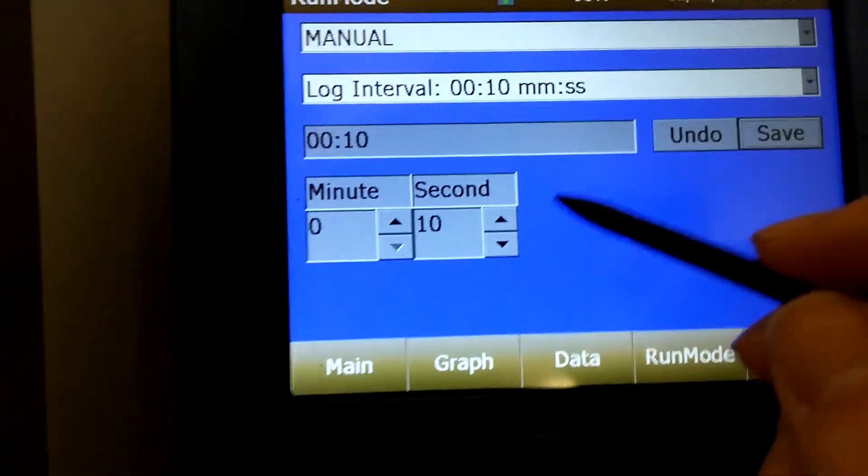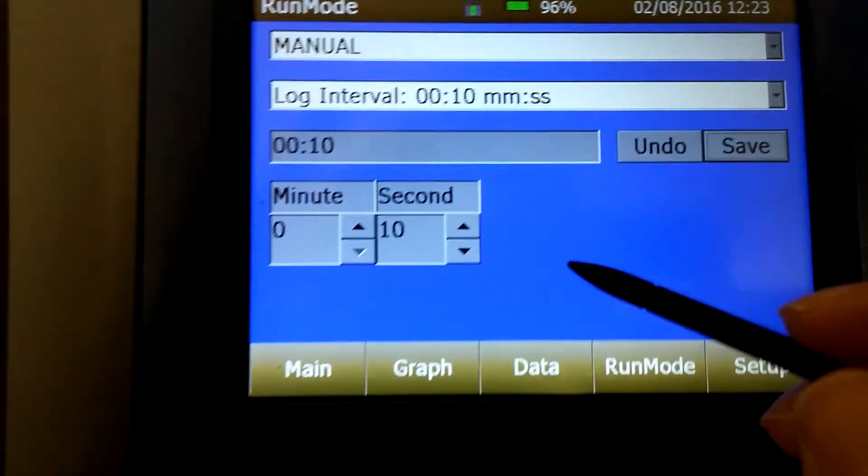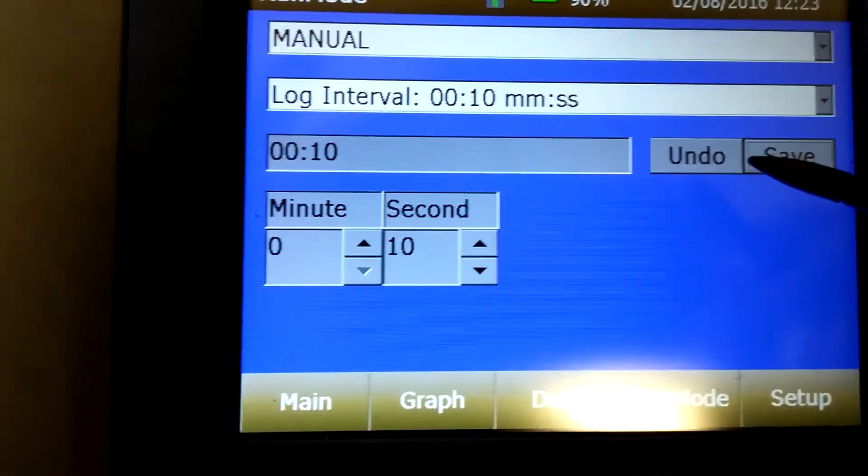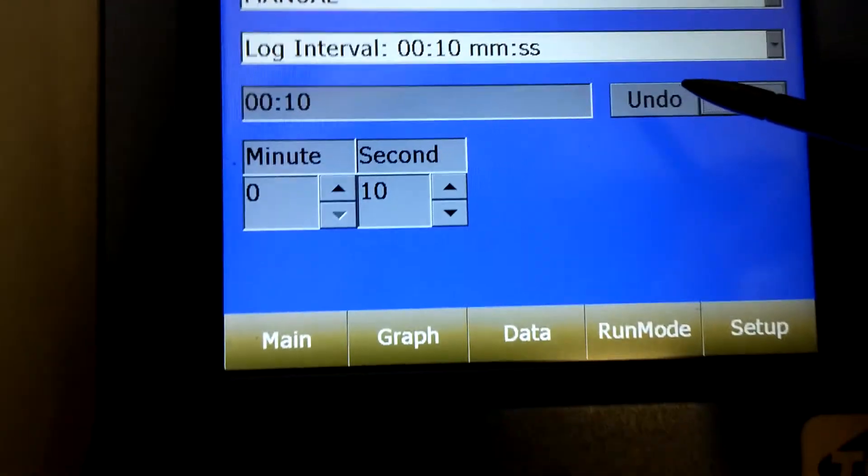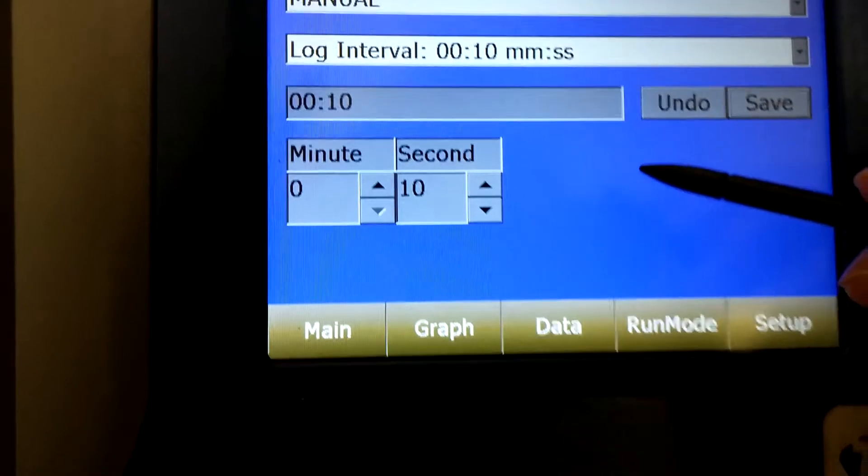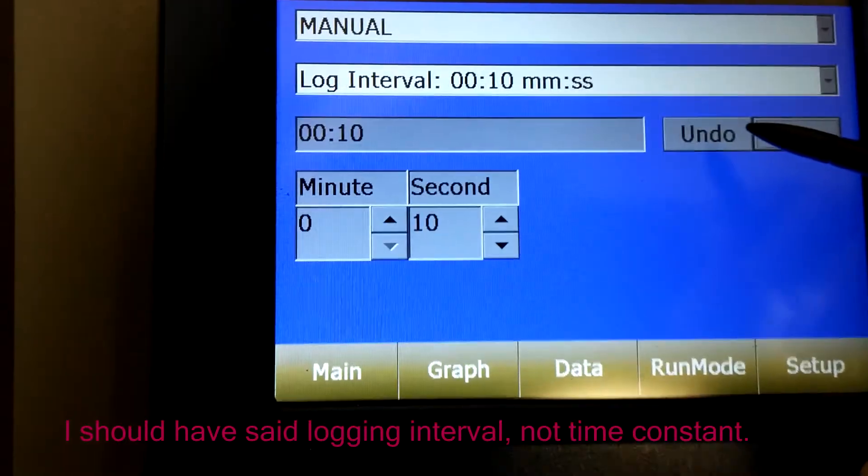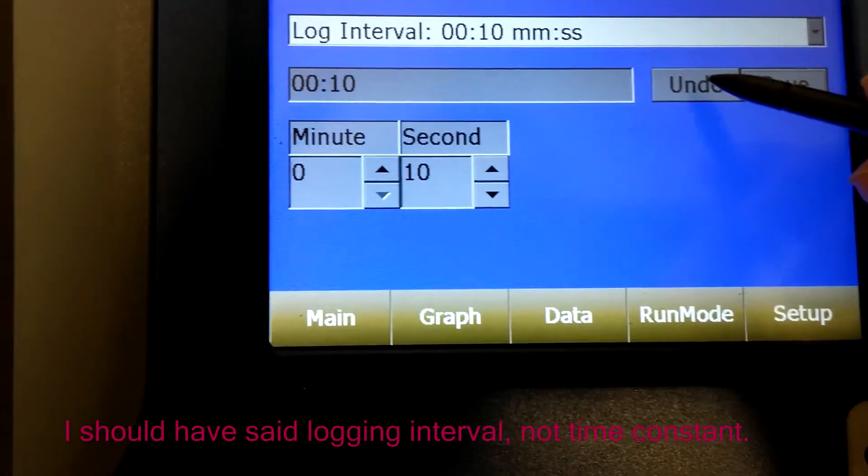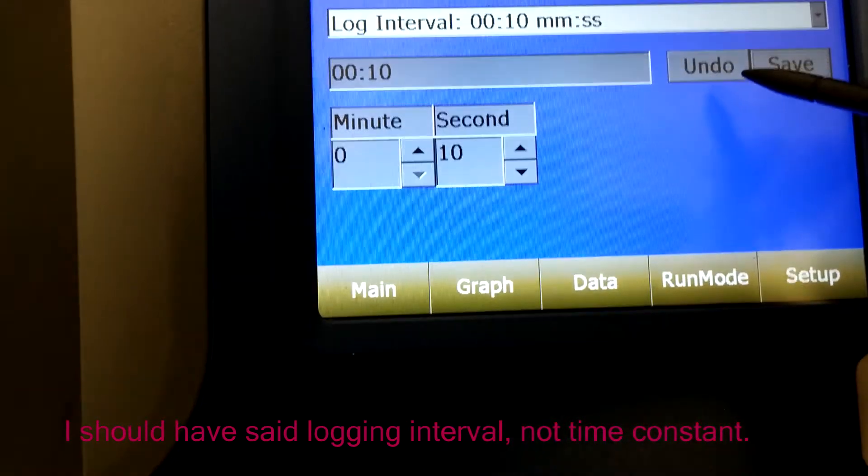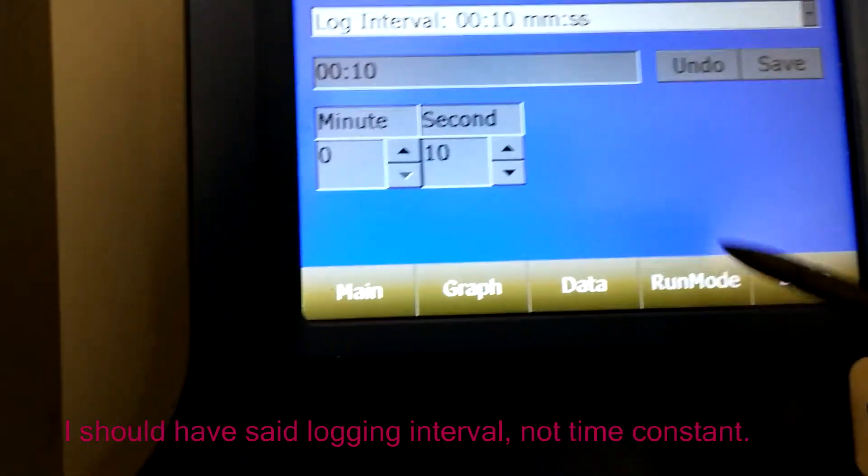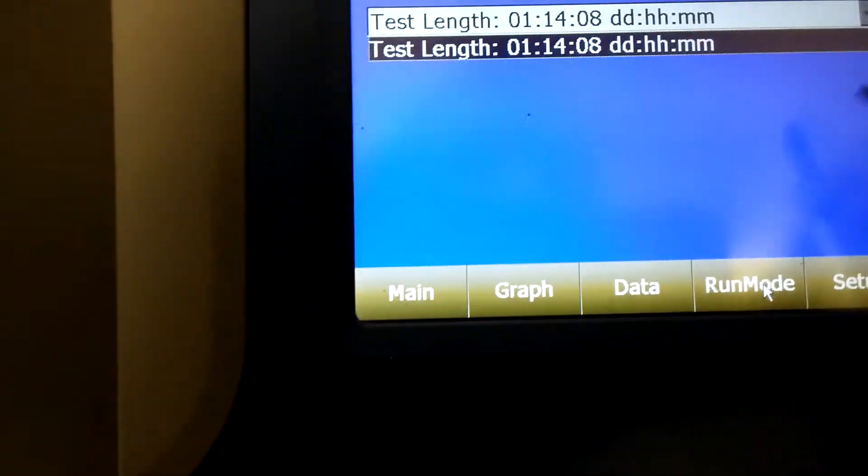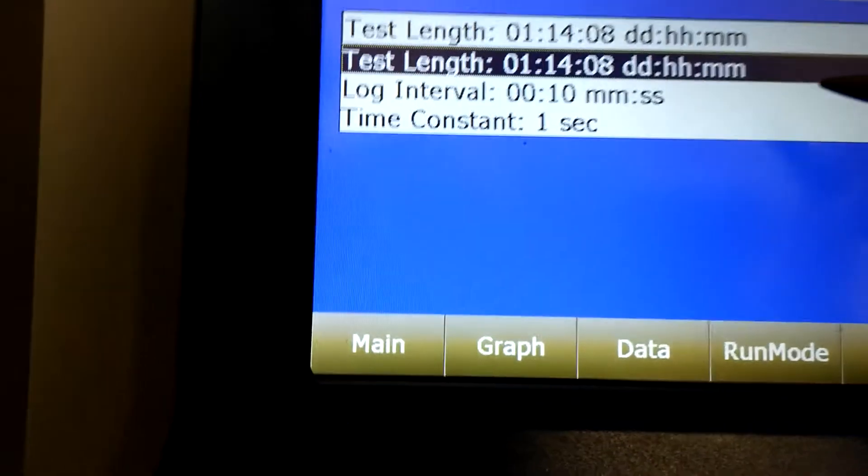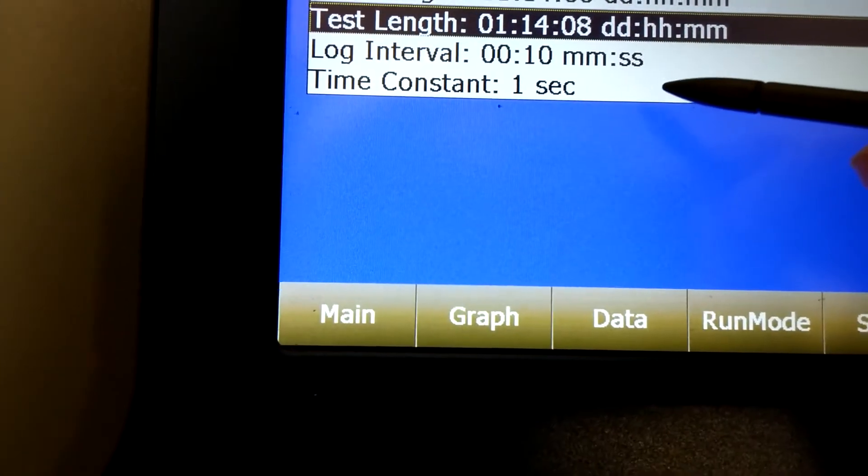Always consult with Professor Choudry before starting your data sampling so you know the correct time constant. But unless you're going to be sampling for very long periods of time, 10 seconds should suffice. Time constant should be 1 second.